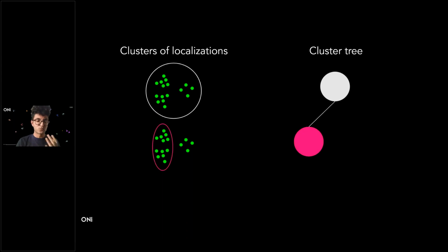We could say there's one cluster here on the left, and these 4 points on the right, they're a bit further away, so they're probably their own cluster. And you can see how these two pink and blue clusters are kind of children of this original white cluster. And that's how we break it down on the cluster tree as well. So you can see these 2 nodes are splitting off from the main root. And we could go even further.